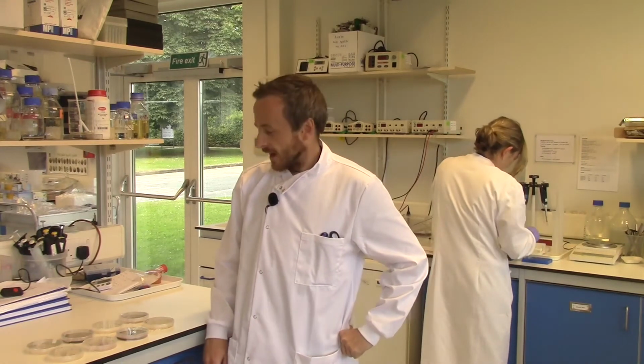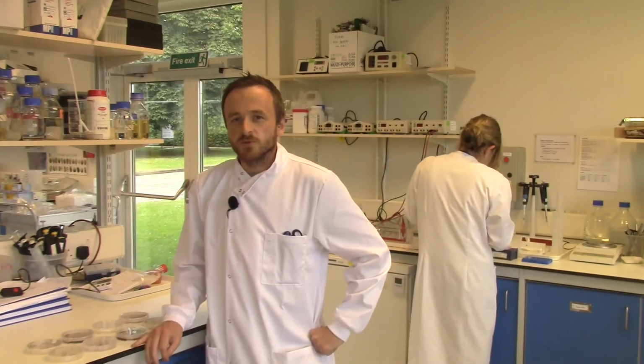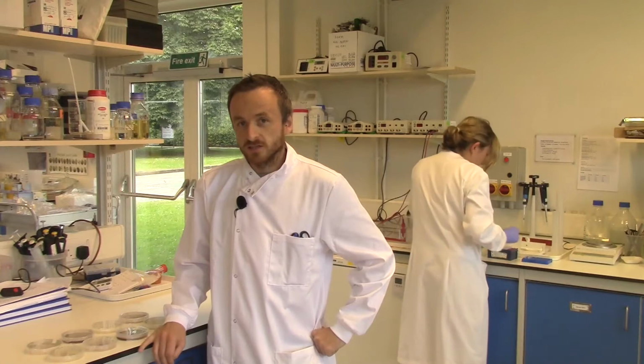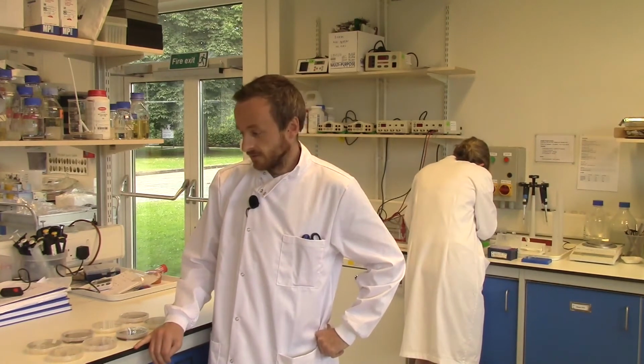So we're here inside our Crop Centre lab at the moment. Our group focuses predominantly on fungal diseases of vegetable crops. So really concentrating on onion and carrot for my work specifically. We've also started to do a little bit of work on peas more recently. And the pathology group is led by Dr.